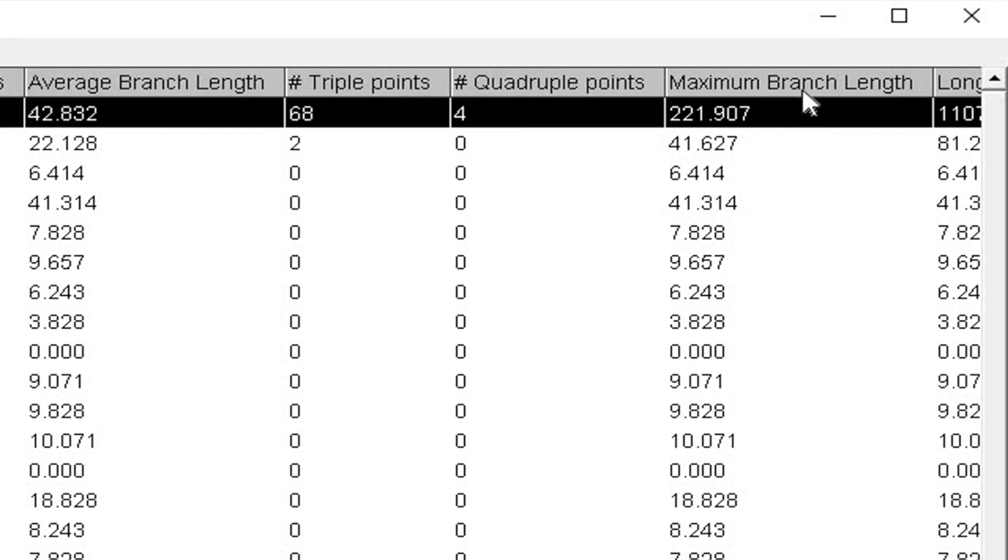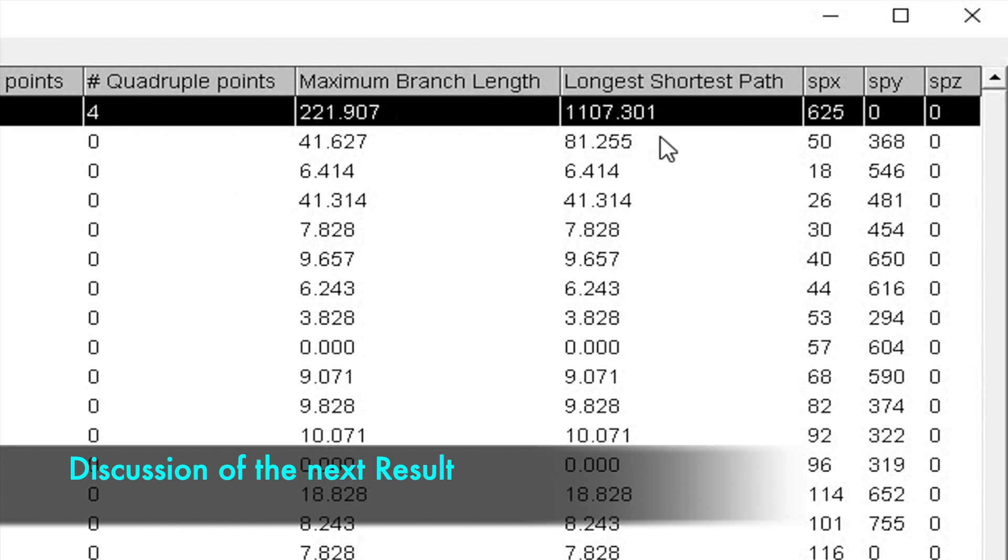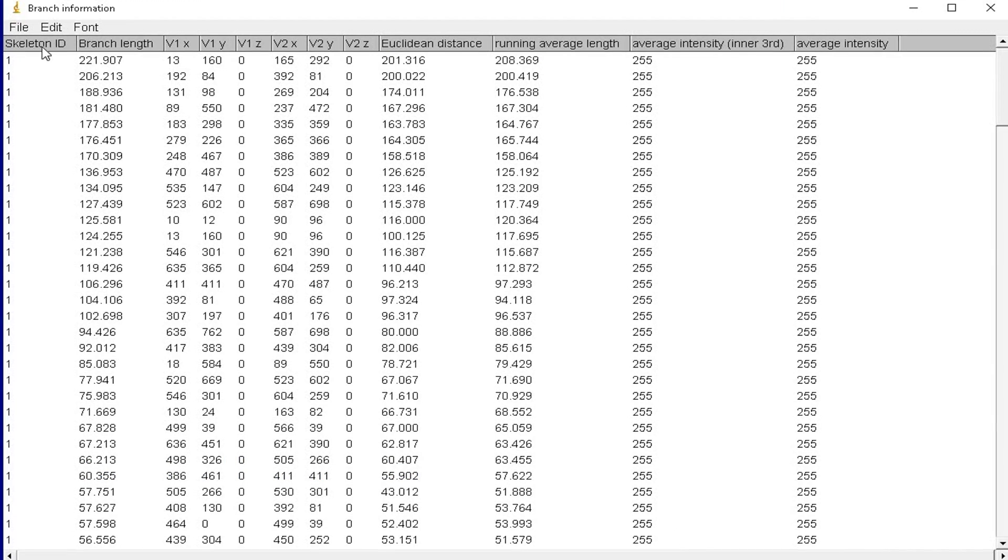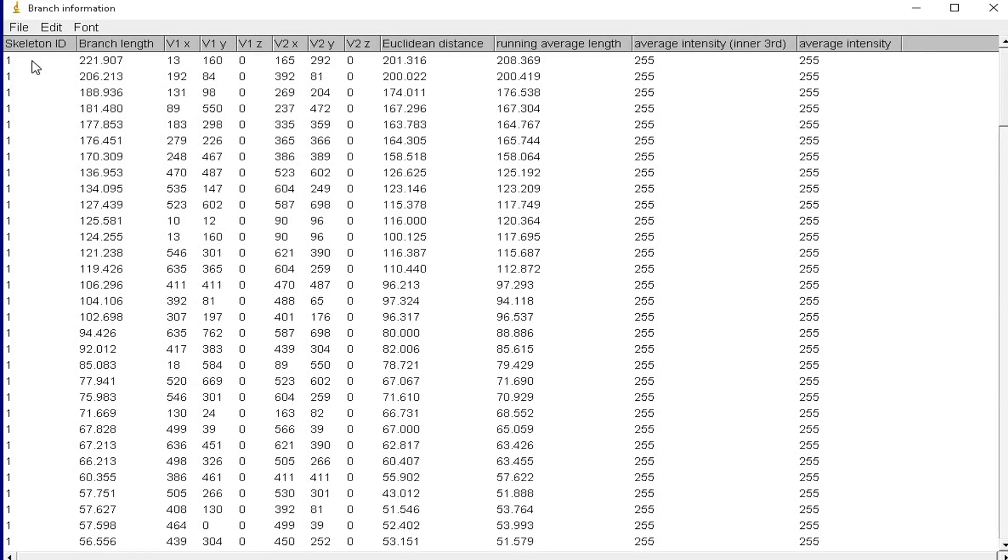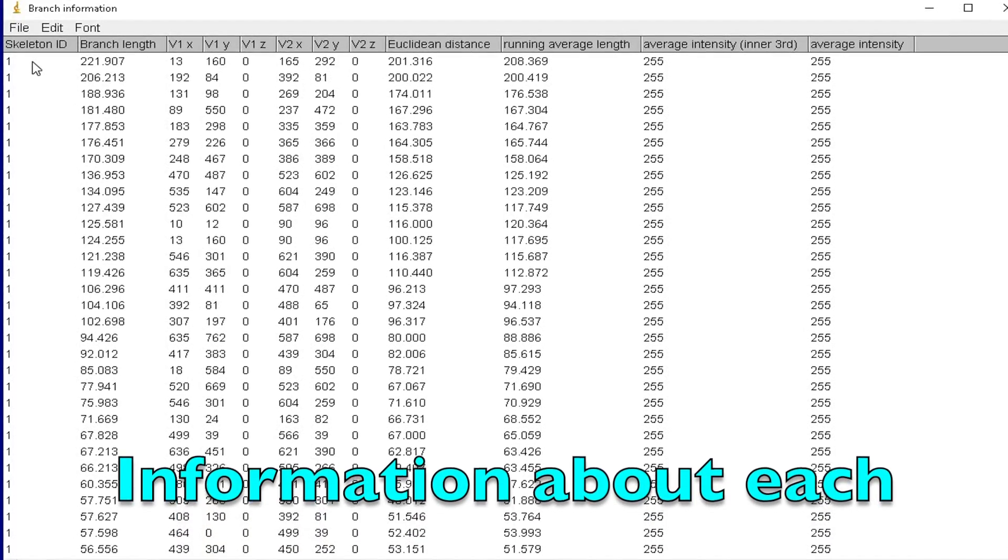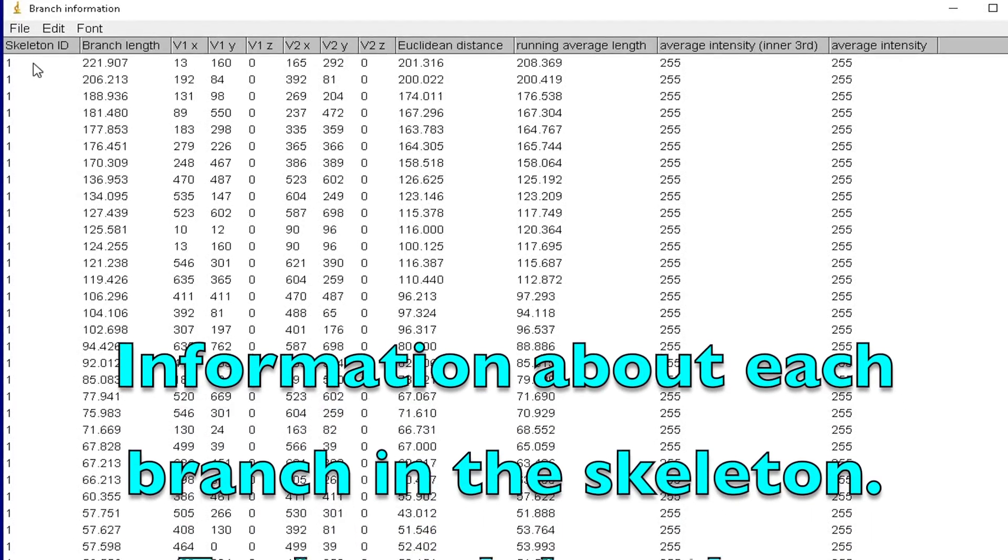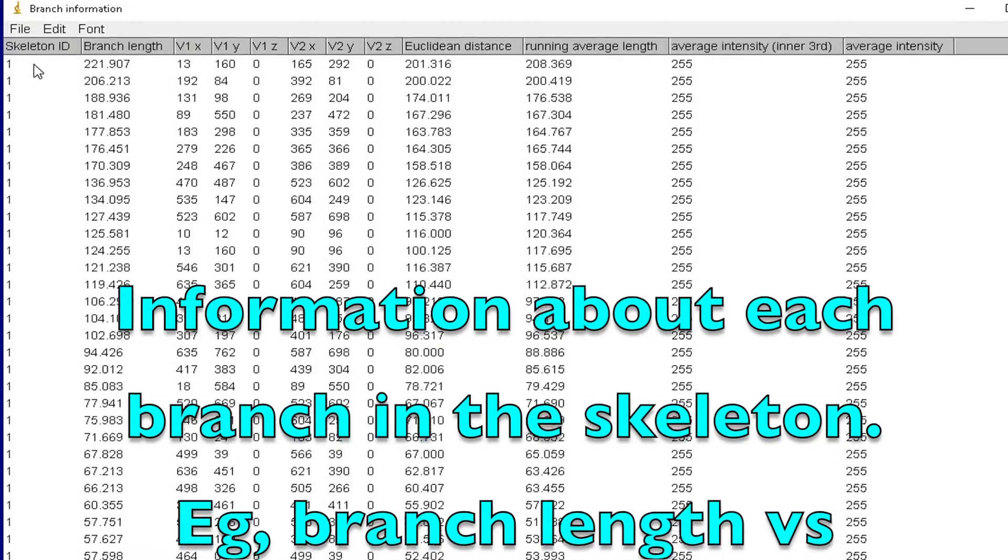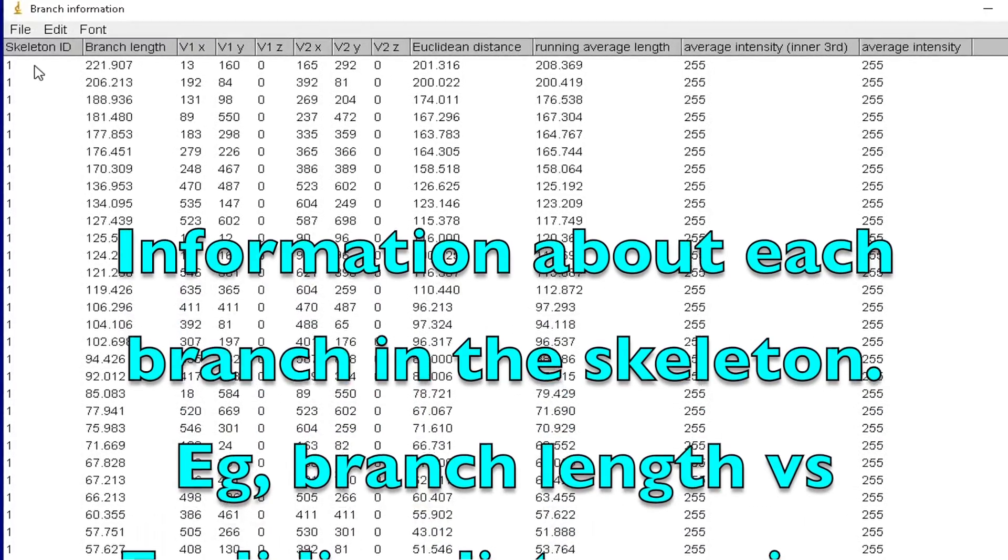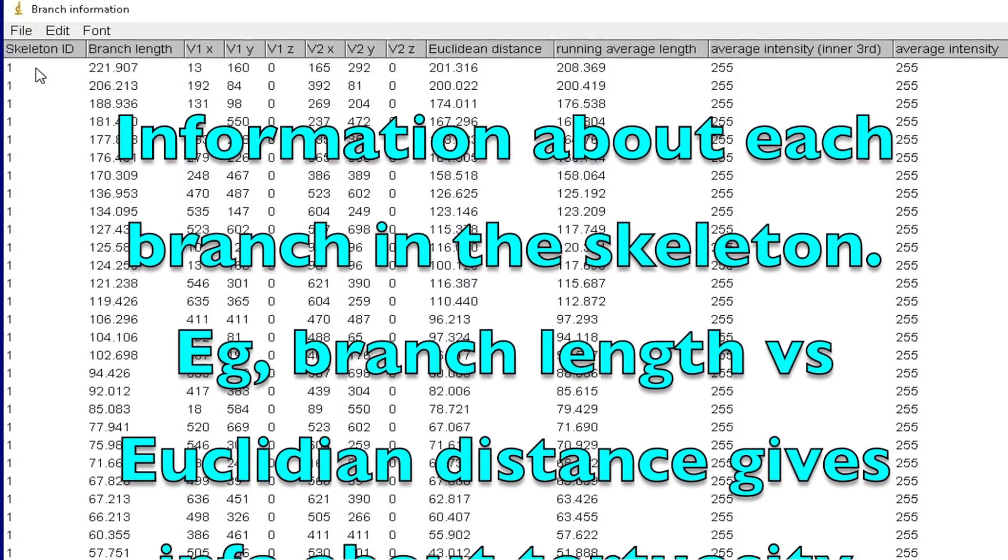In the next column, it displays the maximum branch length and the longest shortest path. In the other result window, it displays other information about each branch in the skeleton, for instance the branch length.